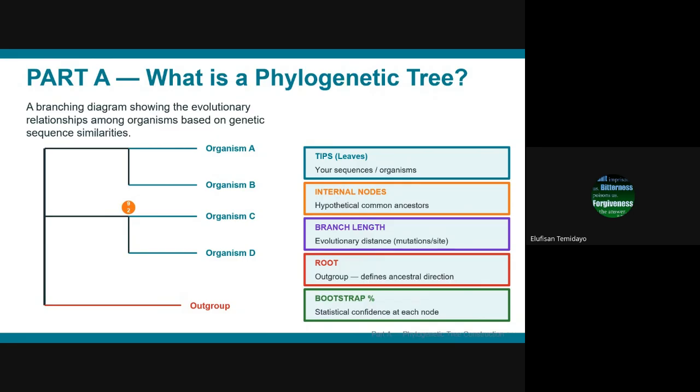Then, like the facilitator that just finished has told us, we do a BLAST, then we download the ones of interest to us. I work more with bacteria, so I'll be talking about bacteria. In this bacteria family, for example, maybe I got E. coli, I got Klebsiella, I got another group of Enterobacteriaceae, and I say, okay, this is an Enterobacteriaceae, but what I got is E. coli. Then I can go and bring out Klebsiella or Yersinia that is close to them, and I'm using that as my outgroup. That will show me how they have come from in their ancestry. So that's what phylogenetics is showing you.